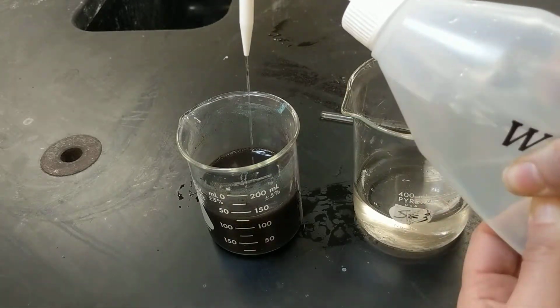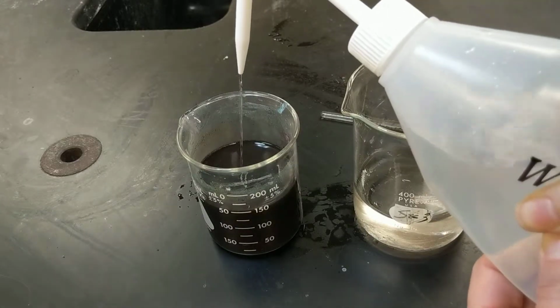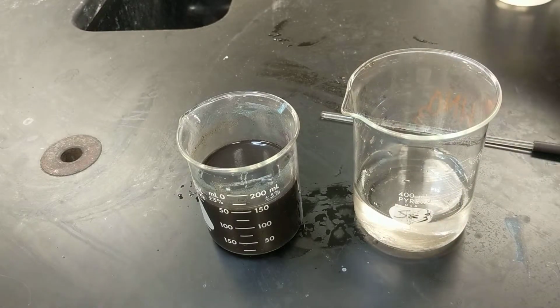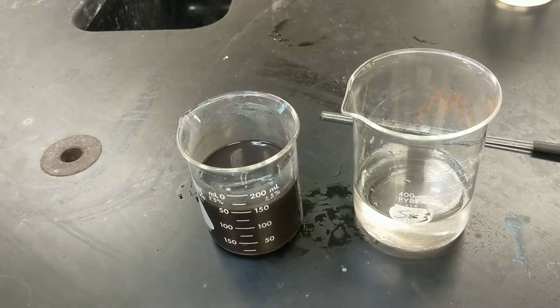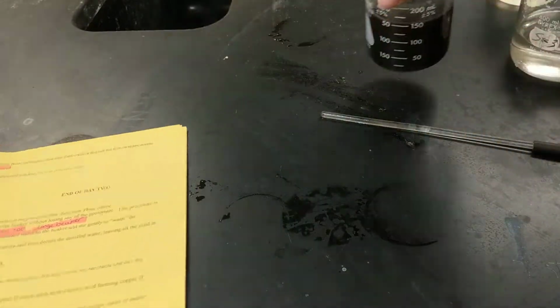So after I add that, it tells me to let it sit for 5 minutes. So for 5 minutes, I'm going to let it sit, and that's going to let my solid settle down to the bottom again. Okay, and then I'd repeat that process to decant. So while that's settling, we'll talk about the next steps.